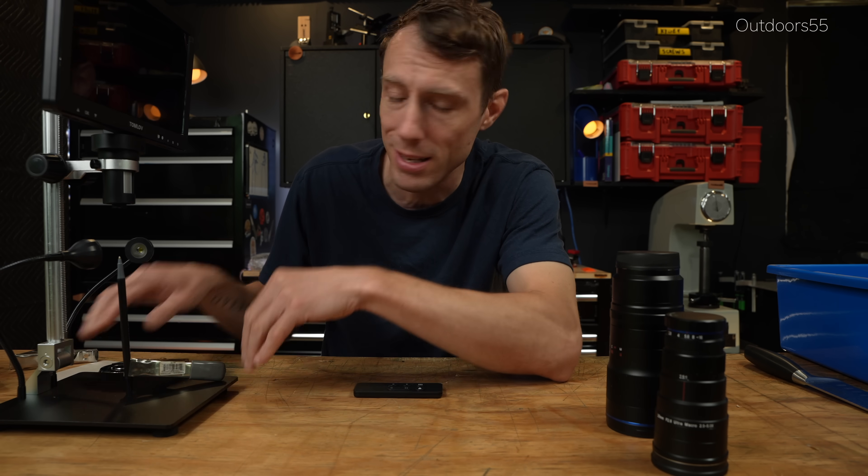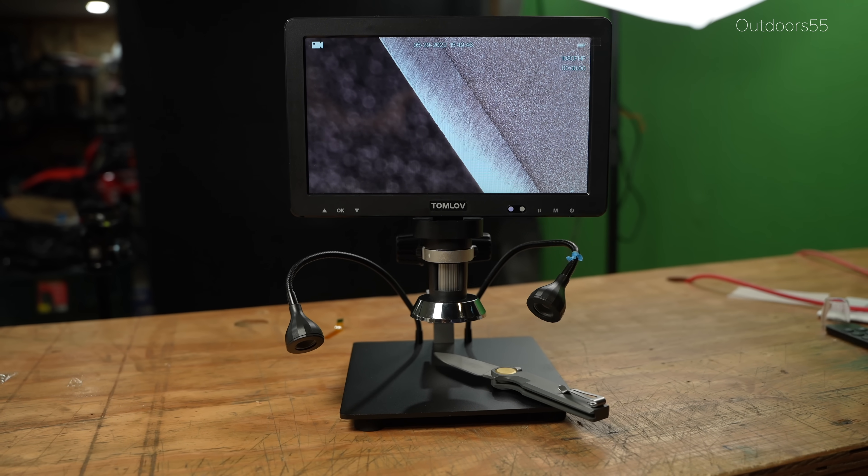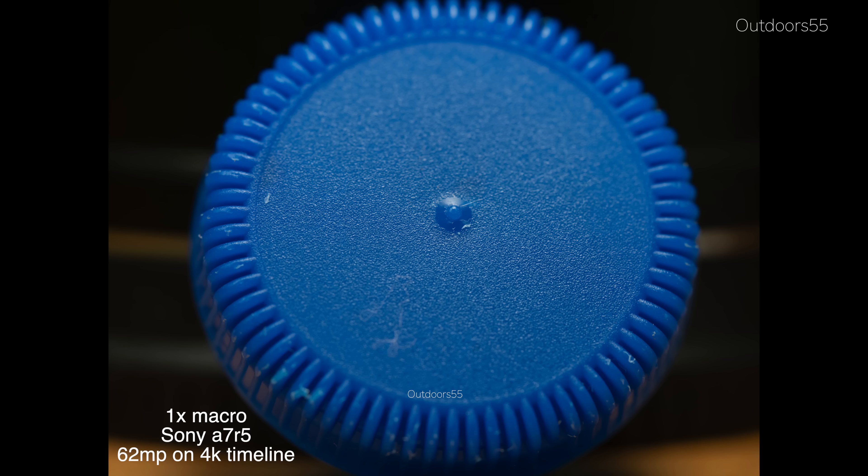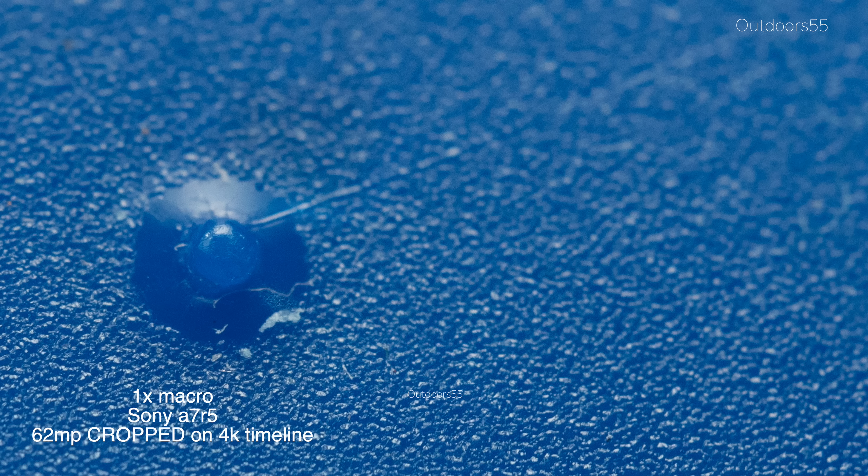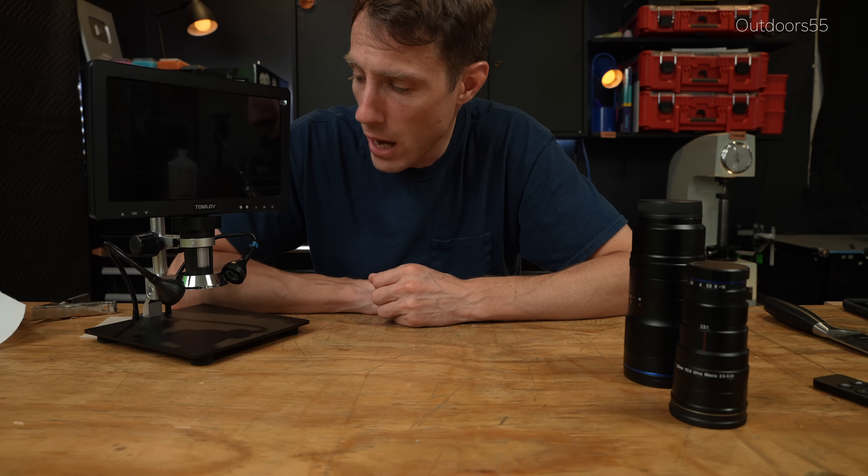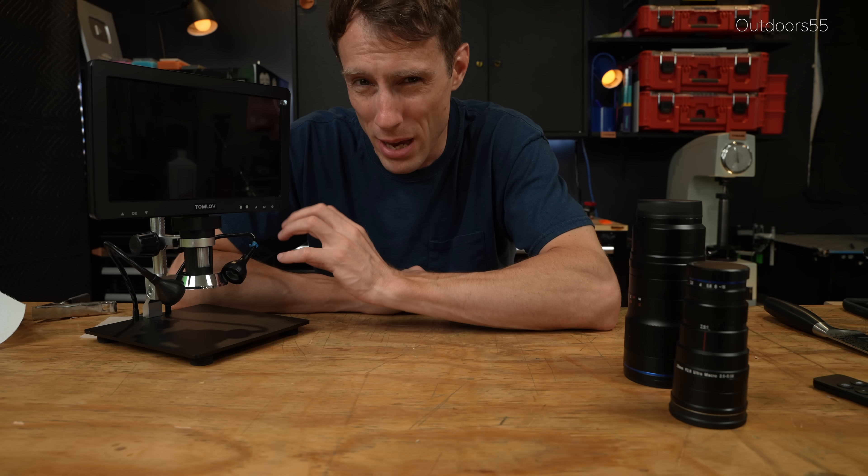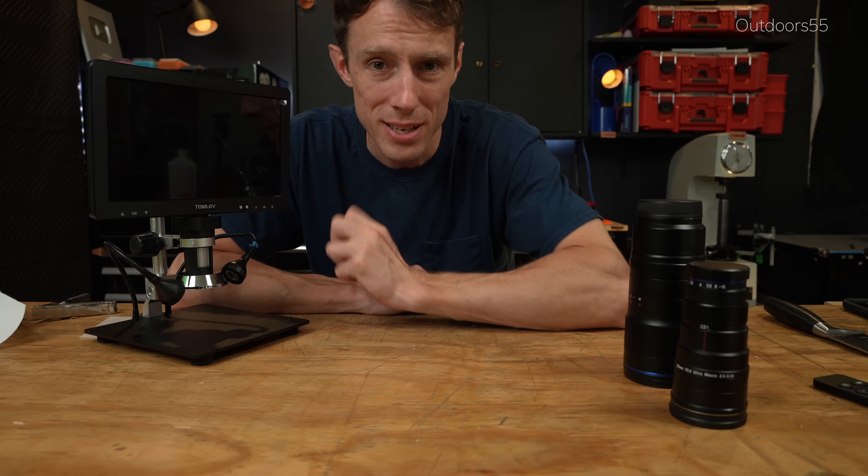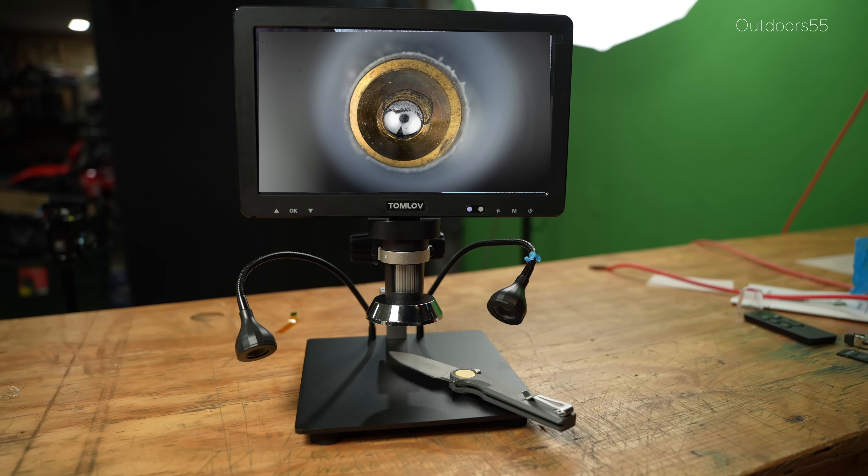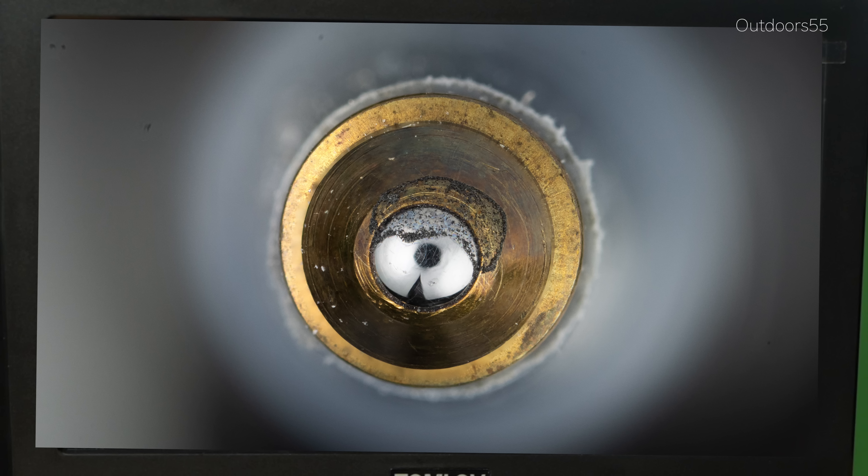Now the reason that you have to understand all this stuff with digital microscopes, which is basically what this thing is. It's essentially just a camera that projects an image onto a screen. Is that a lot of times or the vast majority of times, maybe all the times the actual X factor or magnification factor doesn't have anything to do with how close you're actually viewing the image simply due to all of the factors that we just talked about. Now, I don't know how they got to the 1500X magnification rating that they put on this microscope, but I'm willing to bet that it wasn't from viewing that image on this size of a screen. This is because of the exact size and resolution of the screen you're viewing the image on affects the magnification ratio. Bigger screens and higher resolution give higher magnification ratios.